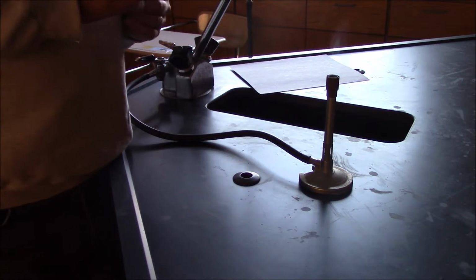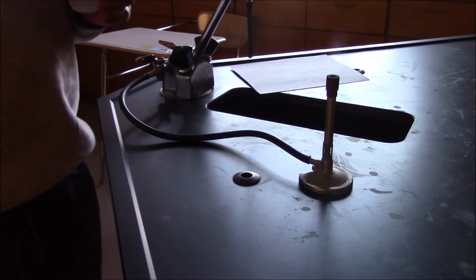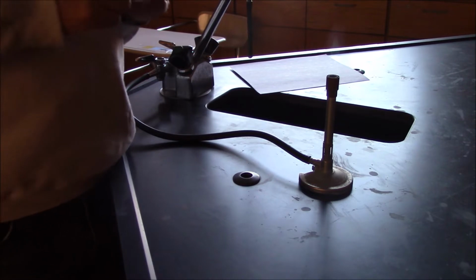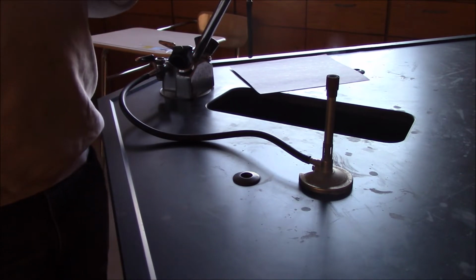So here we have the Bunsen burner flame, and if you look in your lab handout, you'll see there's about 10 chemicals that we're going to do in the flame test. It'll be your job to put the formula of the chemical, the positive ion, the negative ion, and then describe the flame color.